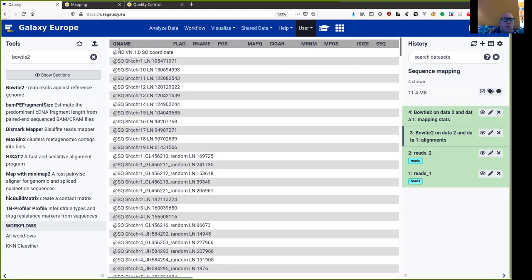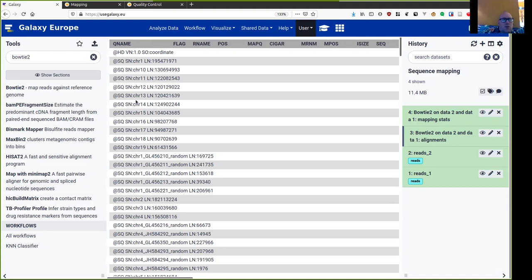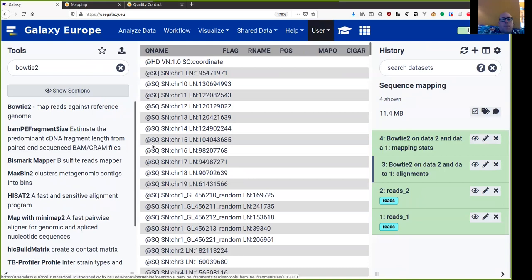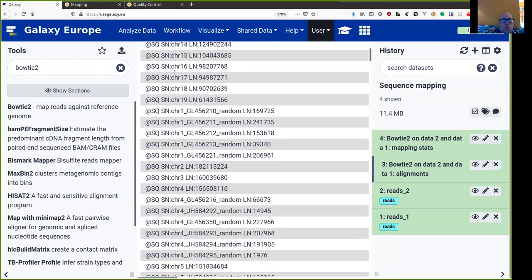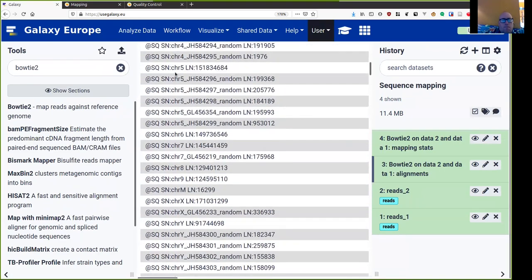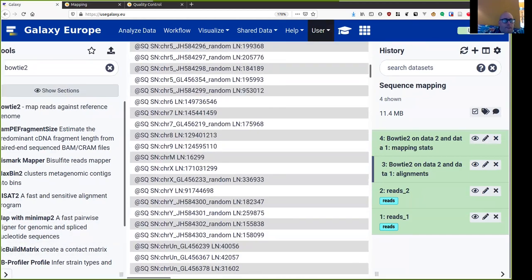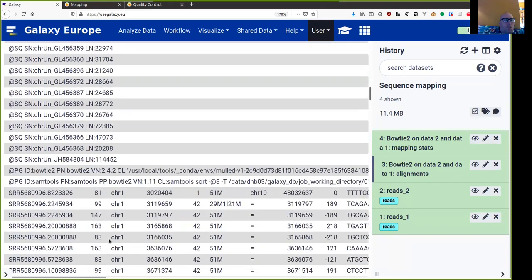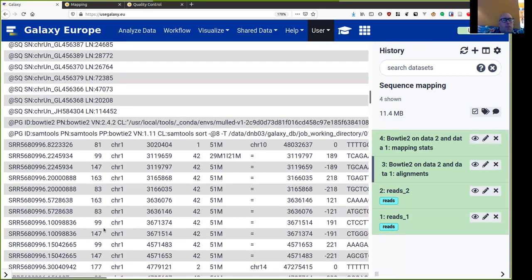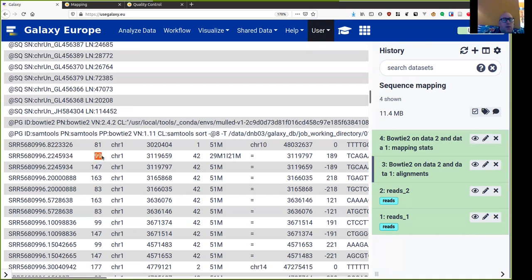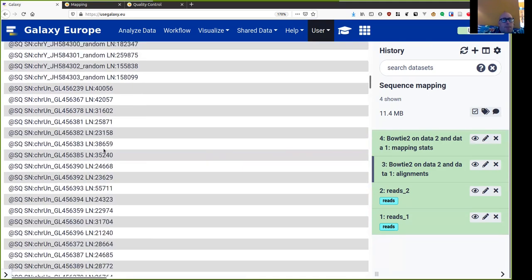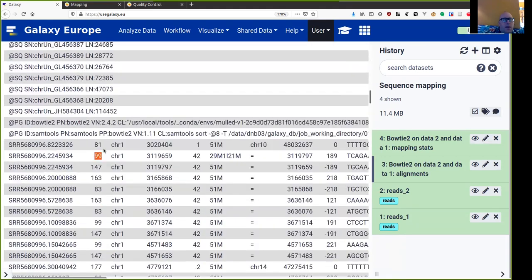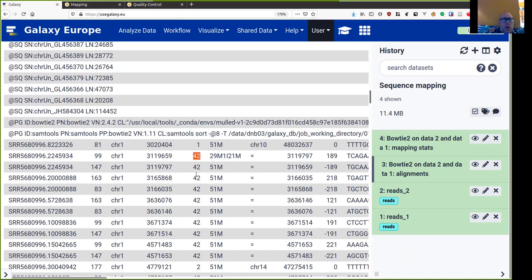And then here at the top, all these lines to start with at signs are header lines. And over here, we see there are different types of header lines. And these are just describing the chromosomes in the mouse genome reference that we've been using. Here we get the actual mapped reads. So here's the read name, the flag. Then we have the chromosome, the position, and the mapping quality. Now mapping quality is an alignment specific figure. There is no standard for what these numbers mean.